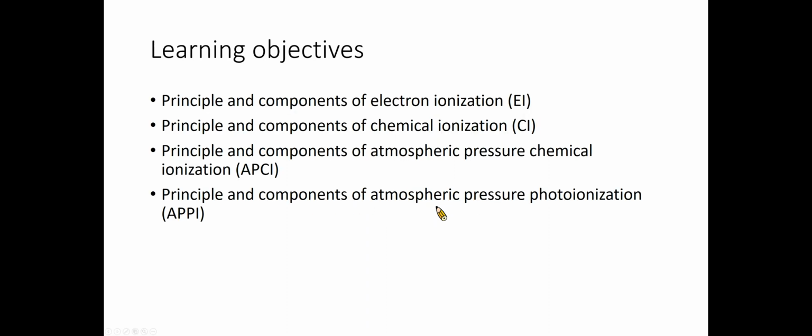In today's lecture, we are going to start our journey of sample ionization. In this lecture, we will learn the principle and components of electron ionization, chemical ionization, atmospheric pressure chemical ionization, and atmospheric pressure photoionization.